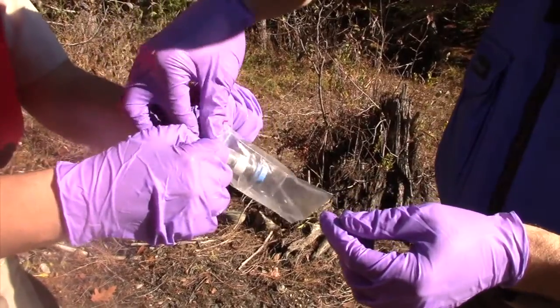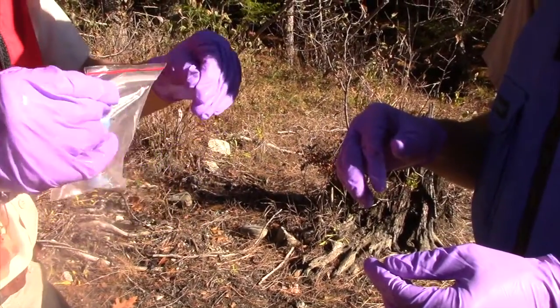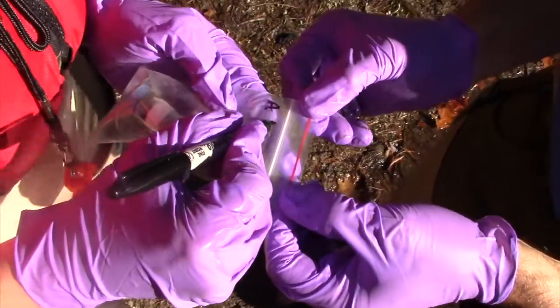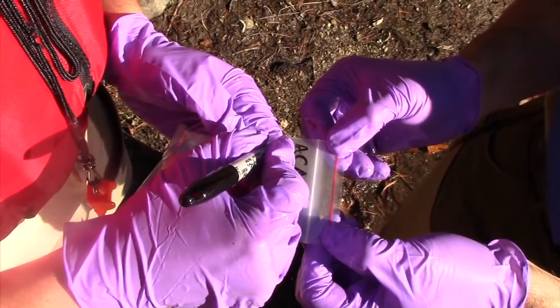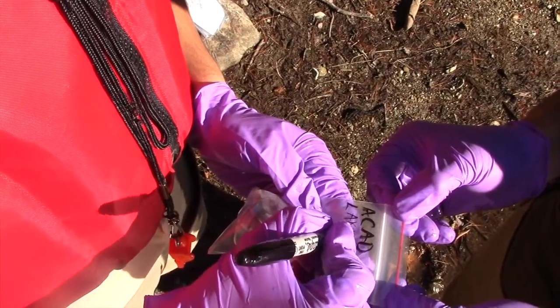Label the bag with your site name and the date using the Sharpie. Make notes about the sediment on the field sheet. Repeat this in the same area two more times. We want three mini-corer tubes from your site. Just reach over a little and start again with a new tube and end caps. No need to change gloves in between.